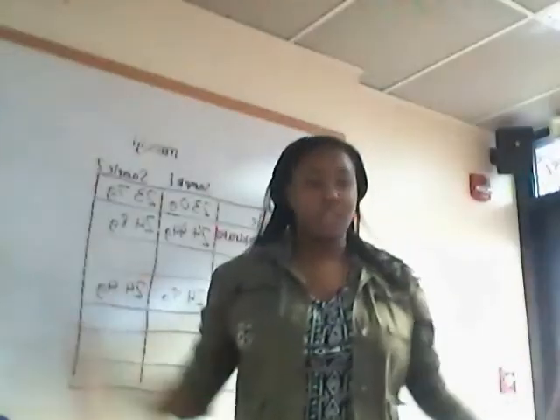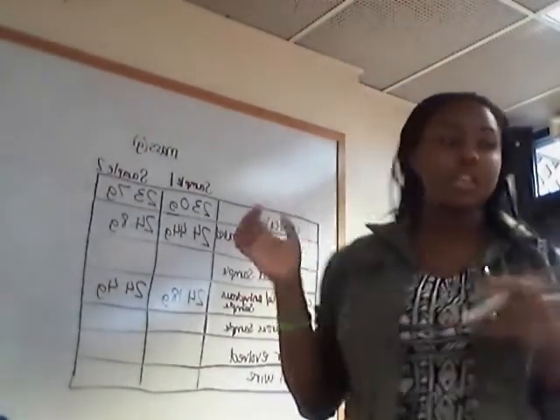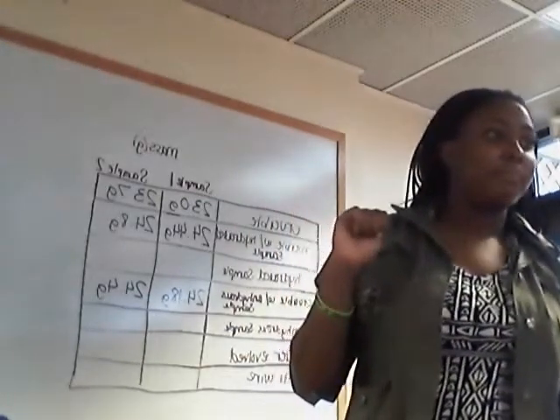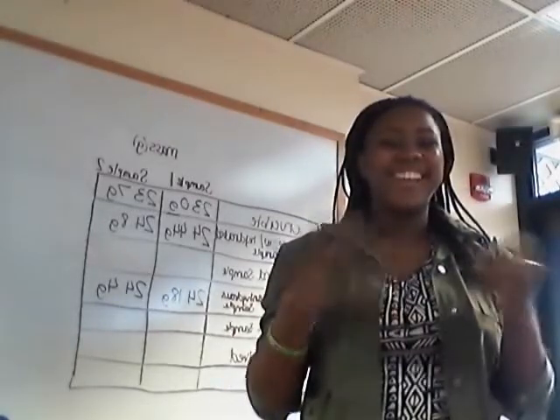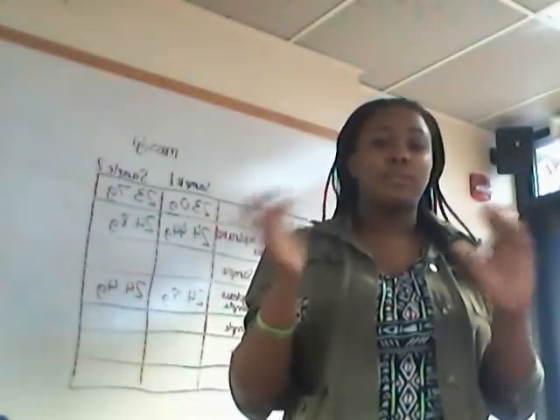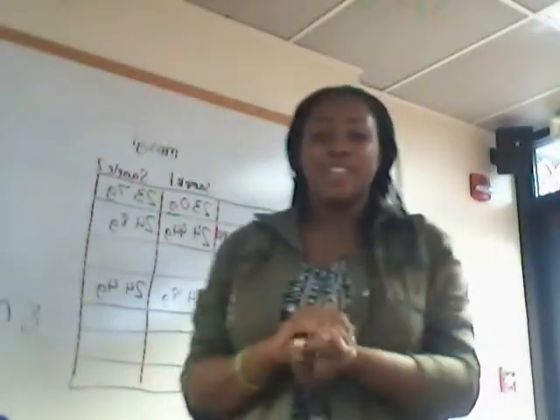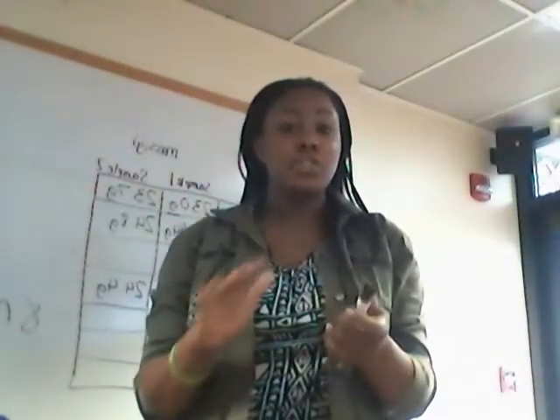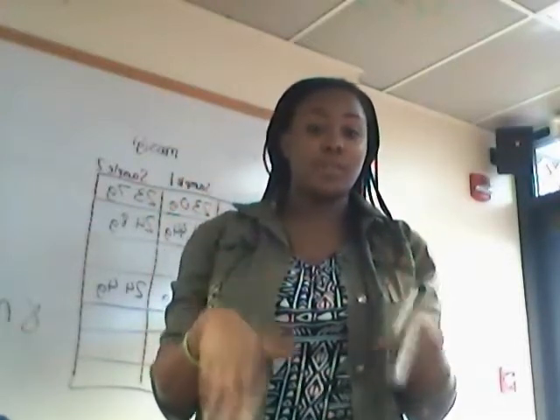So yeah, I'm gonna take over. So the next thing to do when all that is done: you first take the substance in the crucible into a beaker. You rinse the substance from the crucible with a little distilled water, about 8 milliliters. Also, when that is done, you have to use aluminium. I don't know the main purpose of using aluminium in this experiment. What's the purpose?